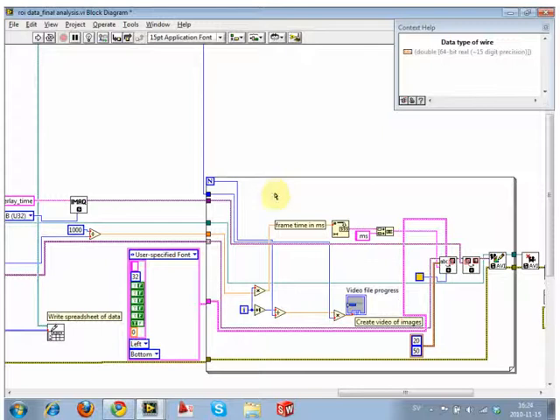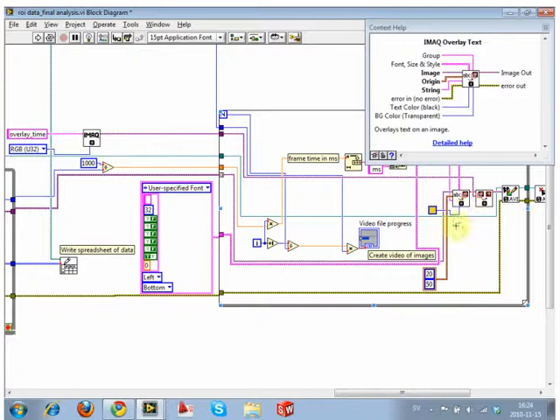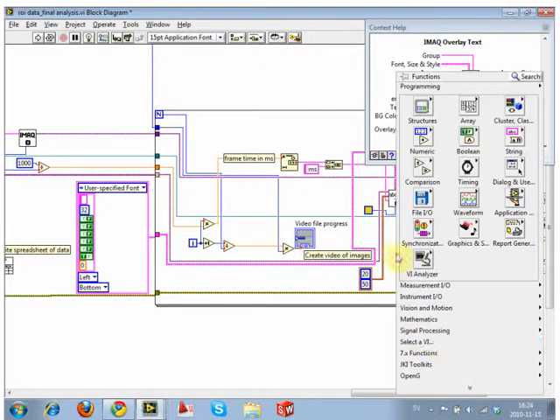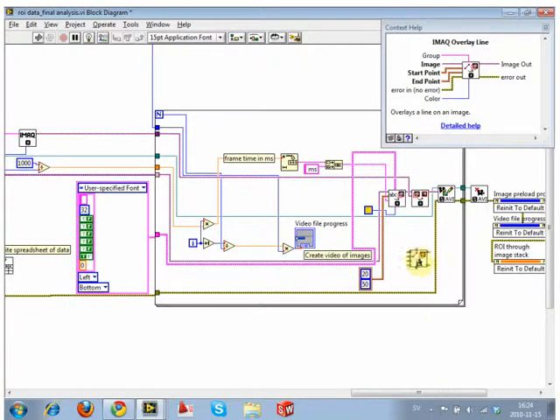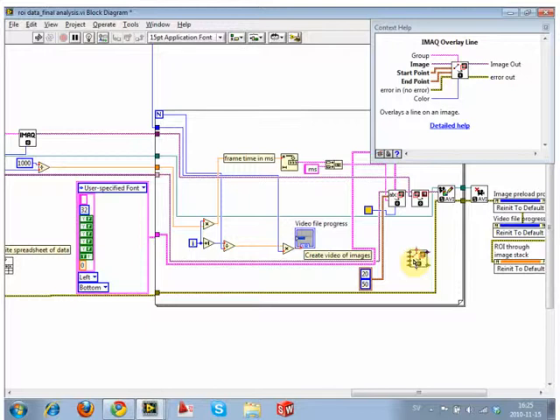But okay, so we have these overlays. Are there any issues with doing a text overlay? I mean, we can go into different overlays. Let me pull up the line overlay. So this is probably the second biggest one, which you'd use for scale bars, but it has very similar properties. Other than having an origin point, which is a single point, this requires 2 data points for start and end of the line. So it doesn't actually ask you how long to draw the line. It just says draw from where to where. But all these parameters are data set specific.